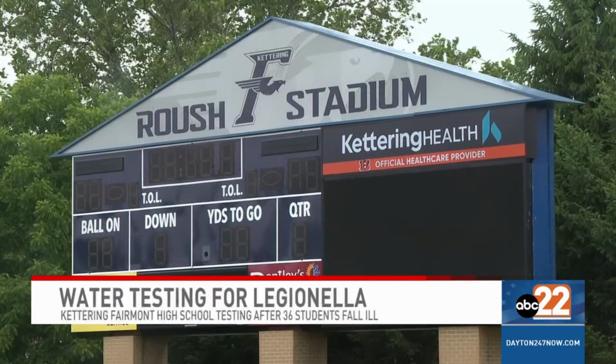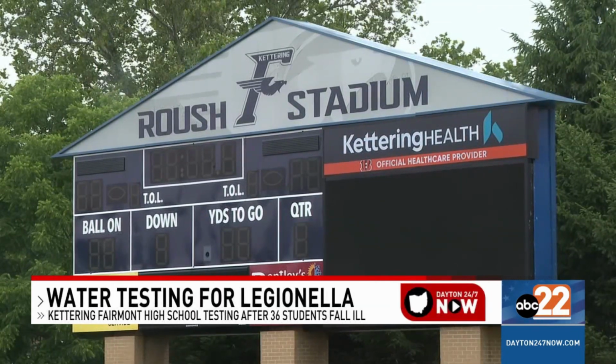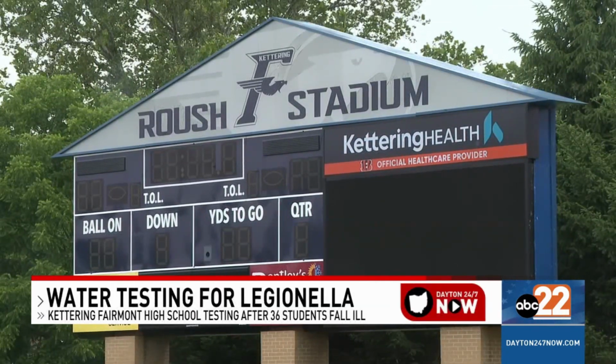We were involved in the testing and investigation that took place in 2020 and have worked with them every year to take environmental samples and help them ensure that their water is safe for use. Solid Blend Technologies sat down with me to explain how the water sampling process usually works.